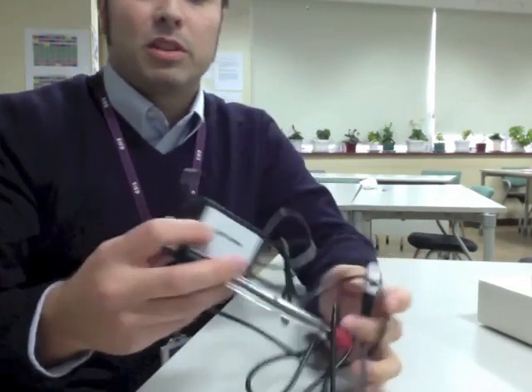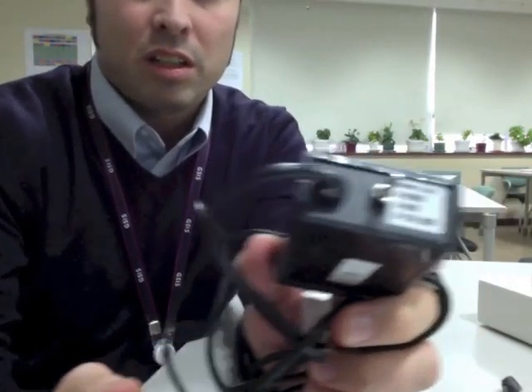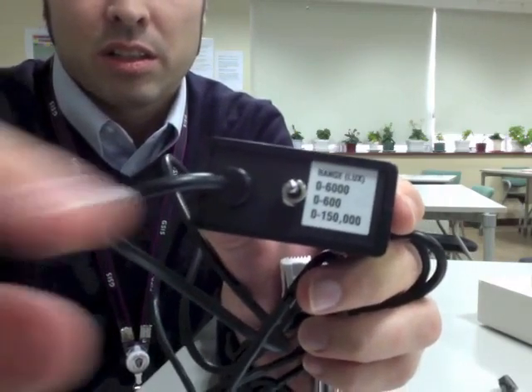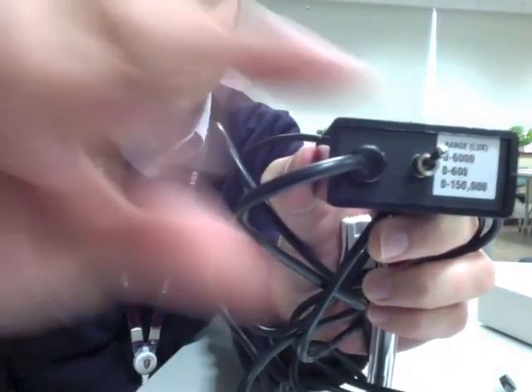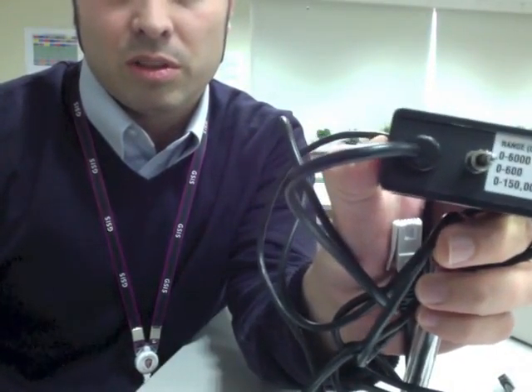So the first thing we're going to do is just make sure and check that the switch is in the center position. In fact, it can be down or up. You just want to make sure it's set in the very center position in the 0 to 600 range there.